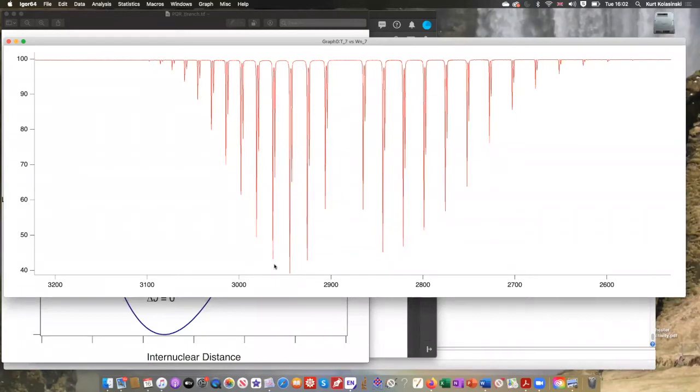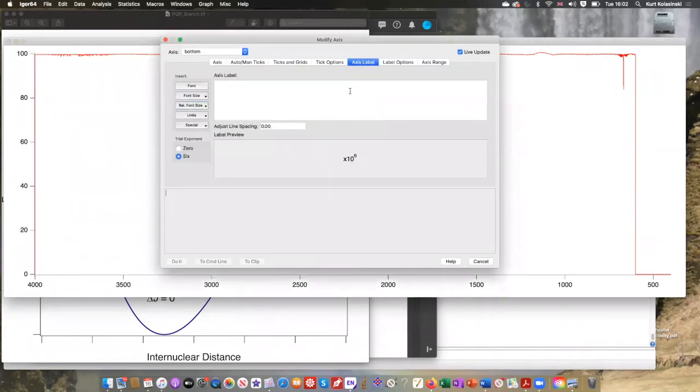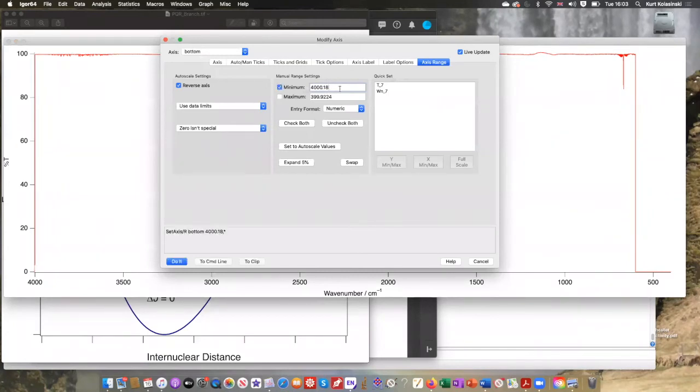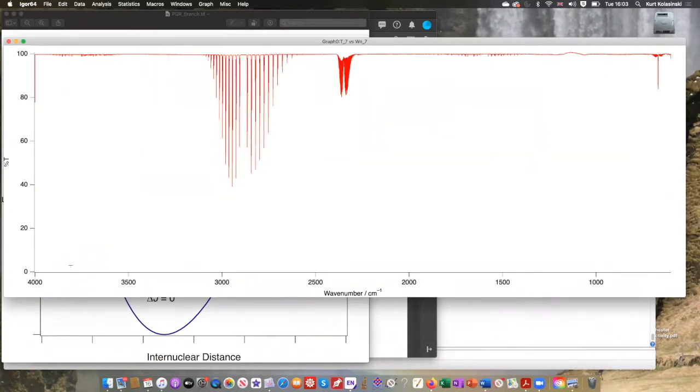Okay, we've loaded this in. Wait a second, let's make this look like a real spectrum. Name the axes, the axis labels. Let's put the wave number on the bottom and the appropriate units on the left-hand side. That's %T. Stick those in there. Great. Do I want it to go all the way to 0? I don't want it to go all the way to 0. What I would like to see is something that goes to 4,000. That's fine. Starts at 600. And I don't need this to go to 0. That's from that fake data out here. I don't care about that.